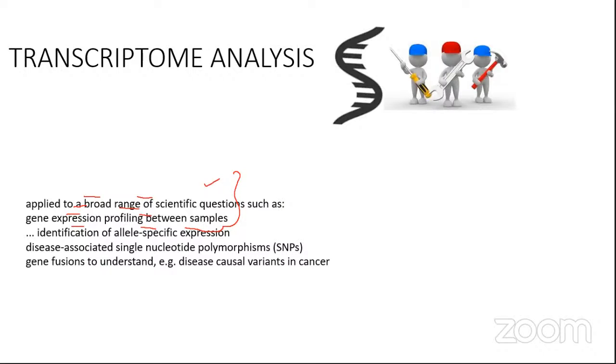What do they mean? So, gene expression profiling between the samples. We can use this information in two ways. Suppose we have one sample, or one organism.